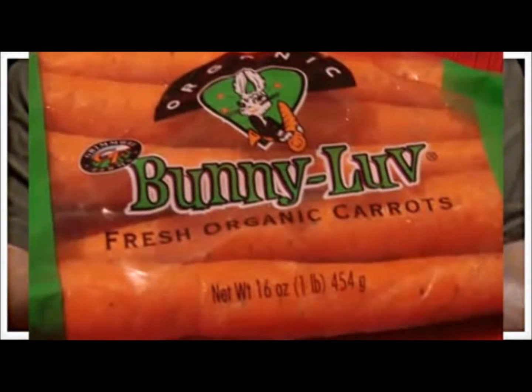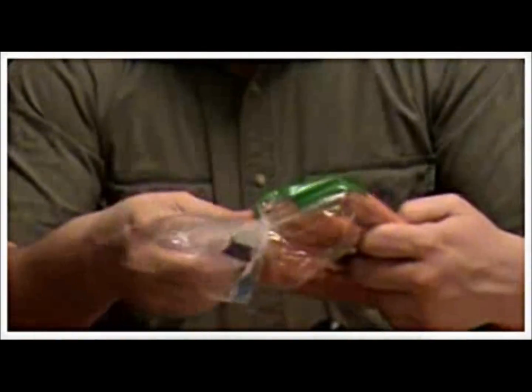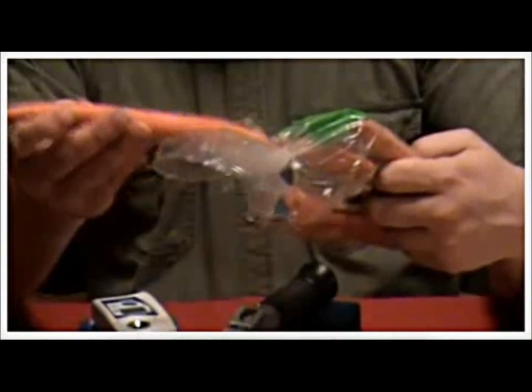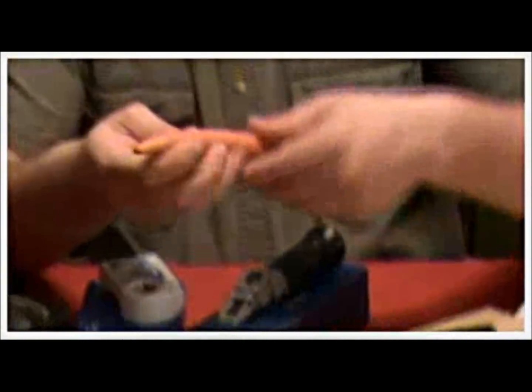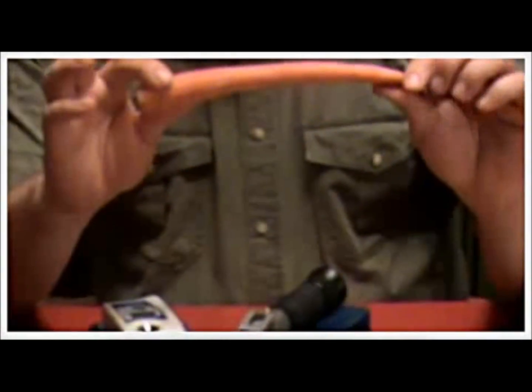Tonight we're going to be doing some Bunny Love carrots. These are organic carrots from California, and in the past I found that these were some of the top carrots as far as the Brix reading. I'm going to select one. The question is: where do you take the Brix reading?